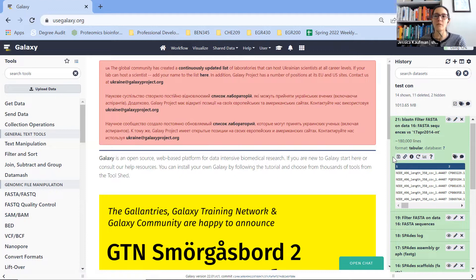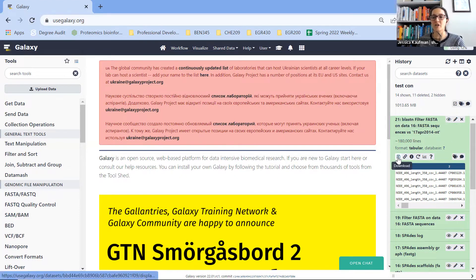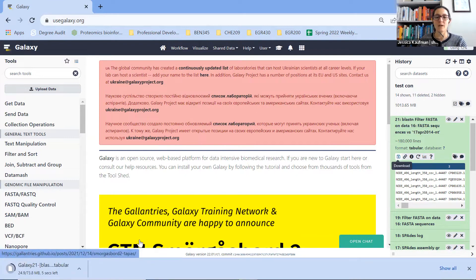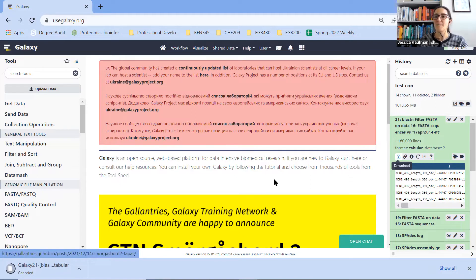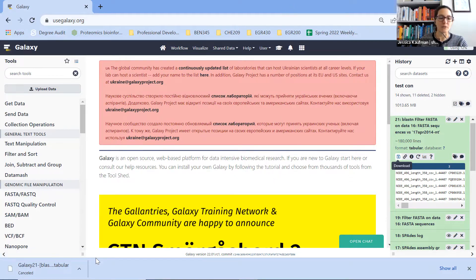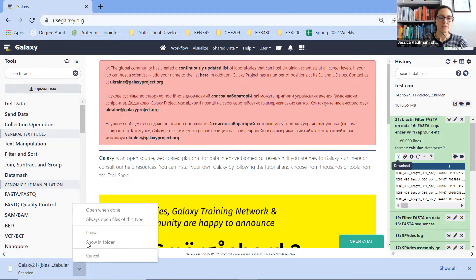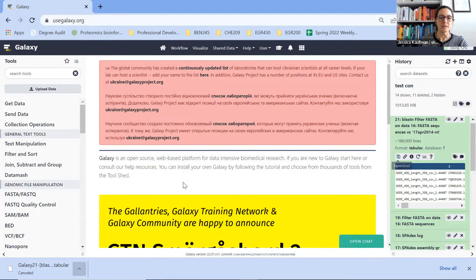The first thing we need to do if we want to look at this data from Galaxy in a spreadsheet is click download. Once it's done downloading — I'm actually going to cancel this because I've already downloaded it — you should be able to open it up in your downloads folder. I'm going to go to Show in Folder, or just open up my downloads.